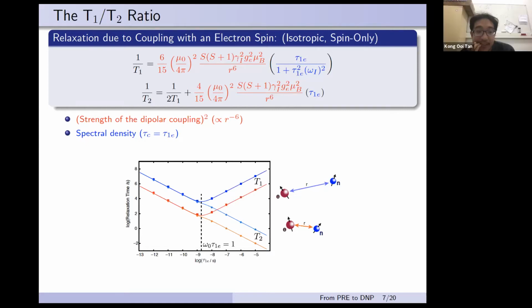Sure. And with temperature, as we go down in temperature, we get longer and longer relaxation. I'm just curious, for these regimes, of course the lithium-6 spin diffusion does not play such a significant role here, right? Yeah, correct. But for lithium-7 it will be different.